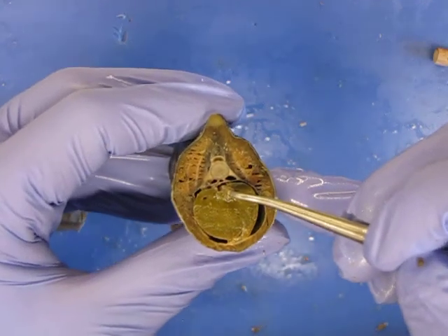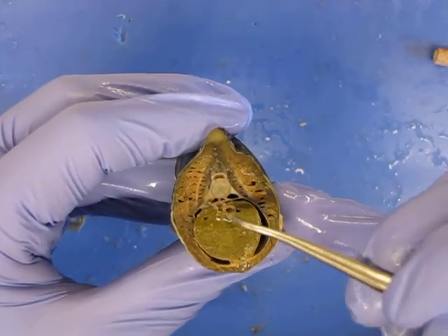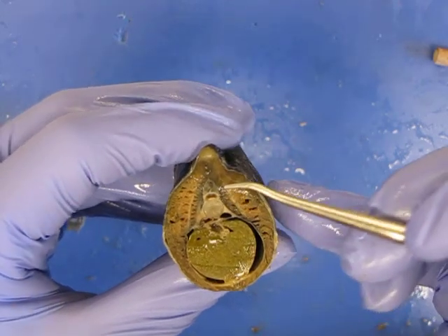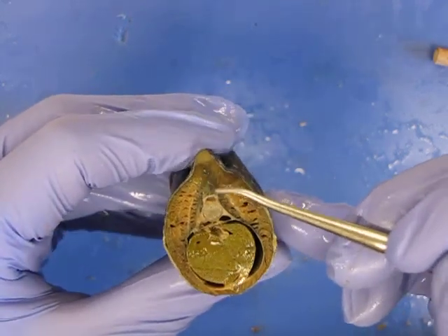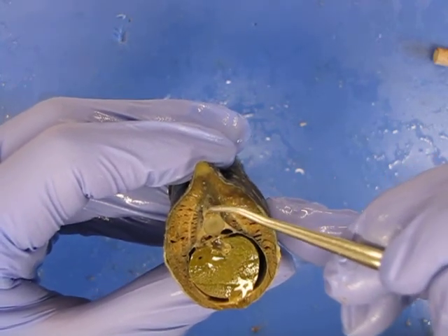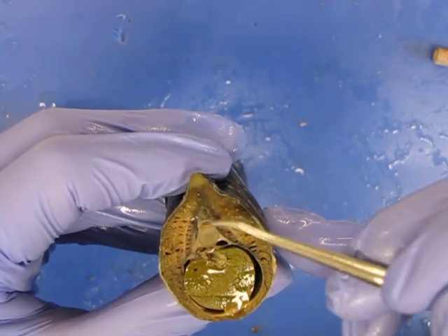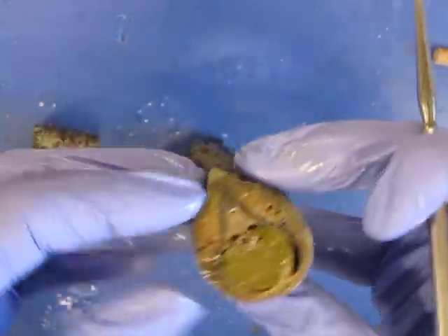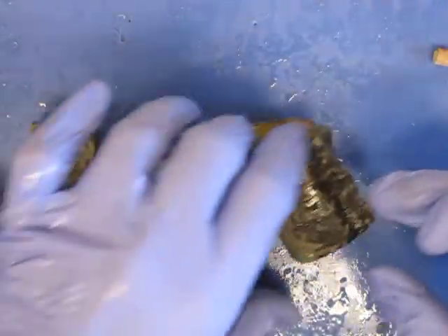I don't know if that's in focus or not. Liver, intestine, dorsal to that. Here are your blood vessels, notochord, spinal cord, and now you can start to see this little triangle, sort of rounded triangle shape. That's the start of that hemopoietic tissue there that produces blood.